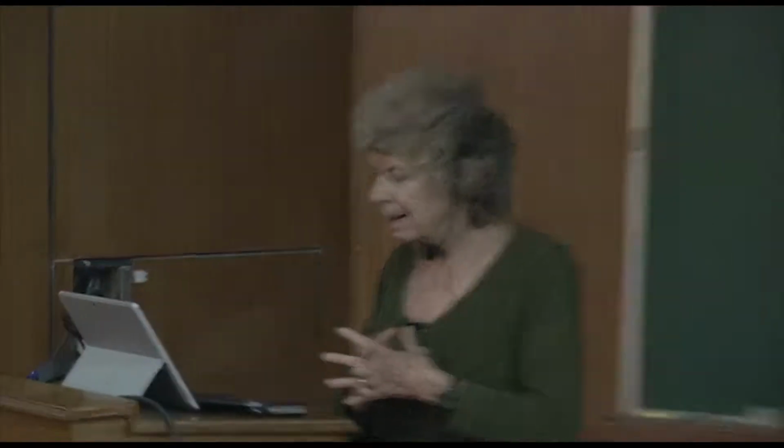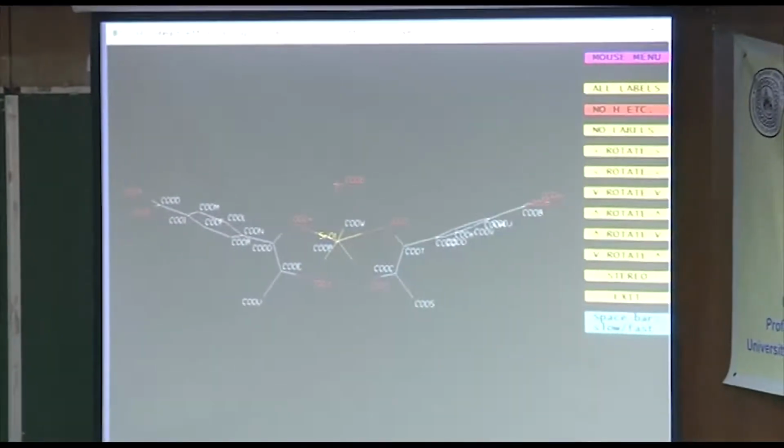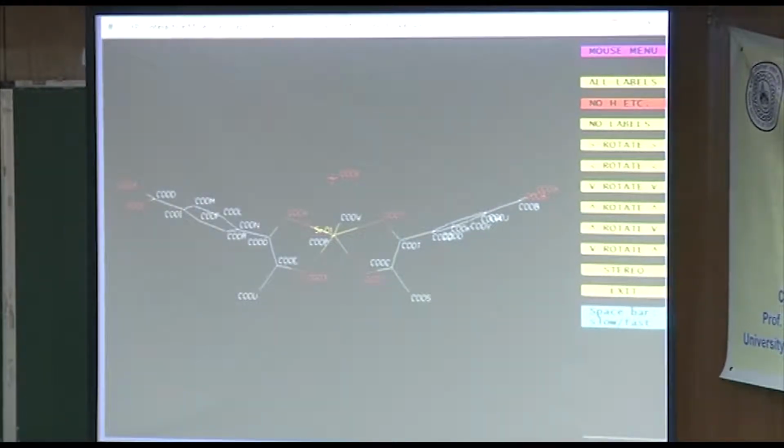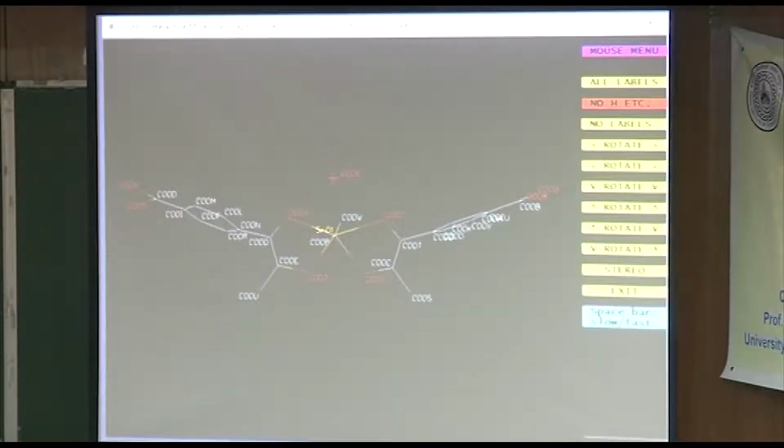Can you see that? Now, I mentioned before that there's this one problem with XT, that it doesn't distinguish among oxygen, nitrogen, and carbon very well. And here you see no nitrogens being named at all, and it does have nitrogen in it. And the carbons are probably correct. But like this group out here at the end is actually nitrite, NO2, so that's got to be a nitrogen there.